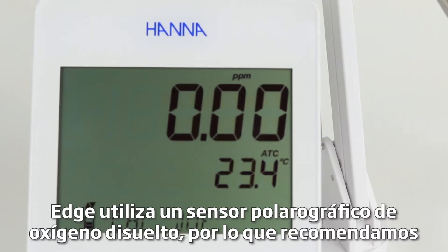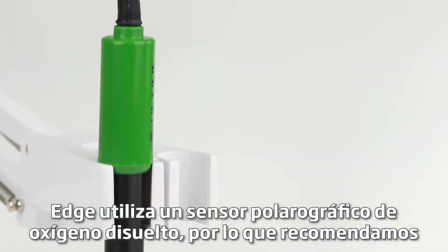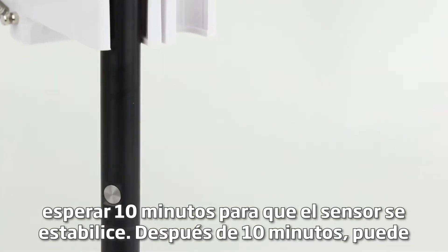Edge uses a polarographic dissolved oxygen sensor, so we recommend waiting 10 minutes for the sensor to stabilize. After 10 minutes, you can begin calibration and measurement.